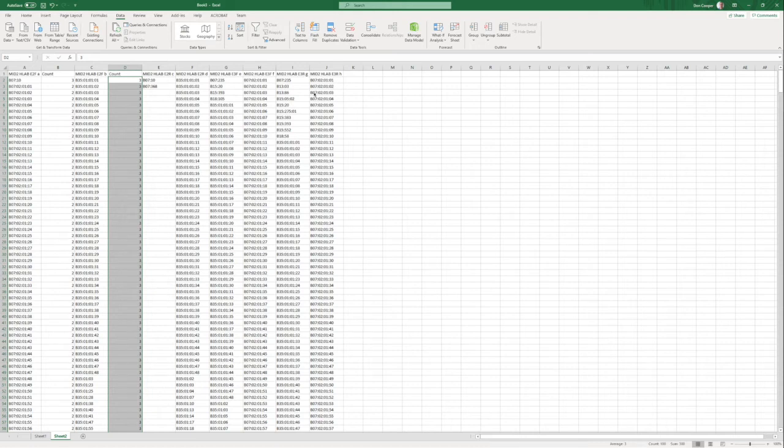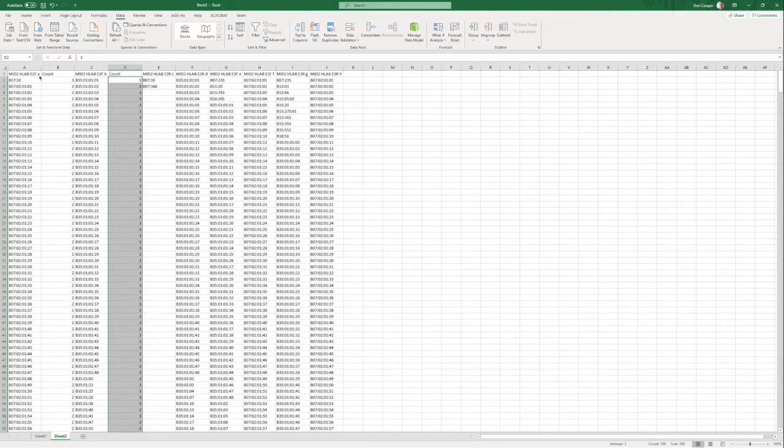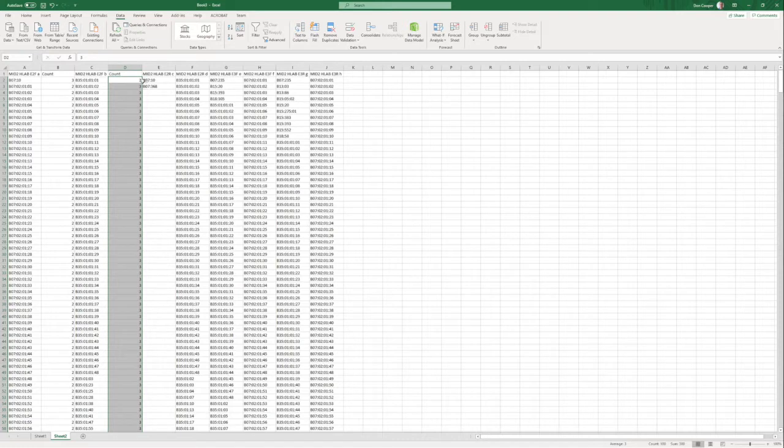Welcome back to the final video for doing the HLA calls on the test data that we gave you. As you remember, we were able to confidently call one of the alleles from the exon 2 forward 2 consensuses, the A forward consensus, which confidently belongs to B0710. We're not confident what the exon 2 forward B consensus leads us to. We have 100 possible answers.